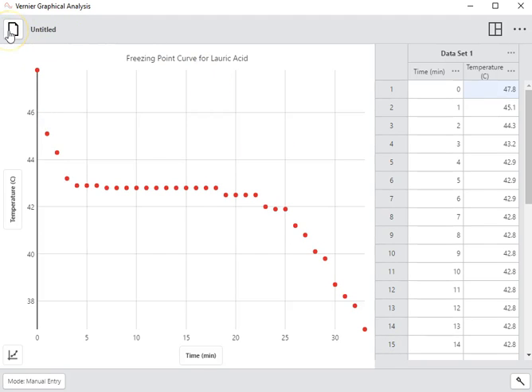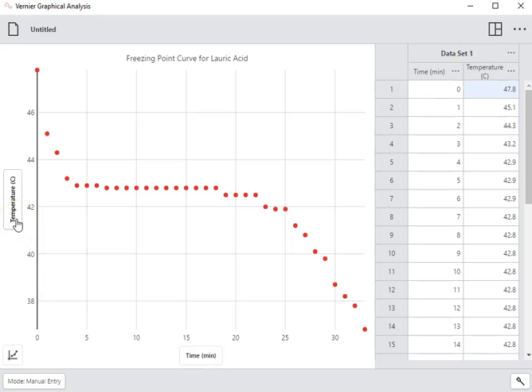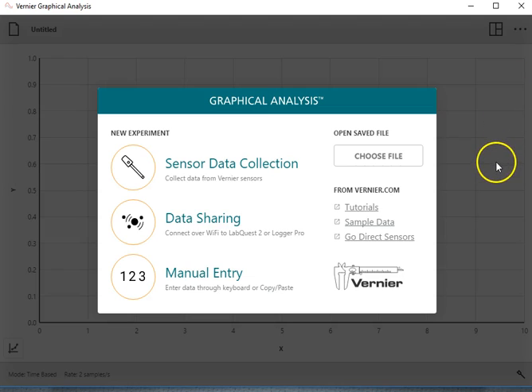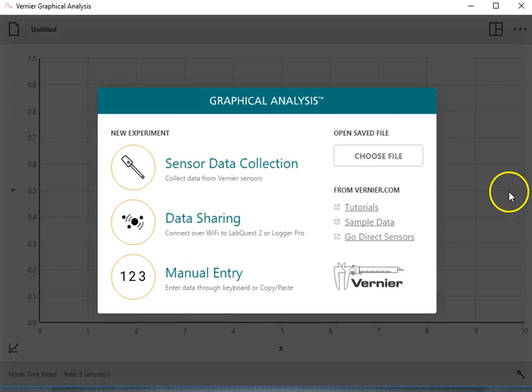The other things I wanted to show you are ways to save the data. But first, I want to point out that by putting in the labels for time and temperature in the column options, it automatically gives you the time and temperature axis labels on the graph as well. Now let me go back and show you some things about the LabQuest itself.